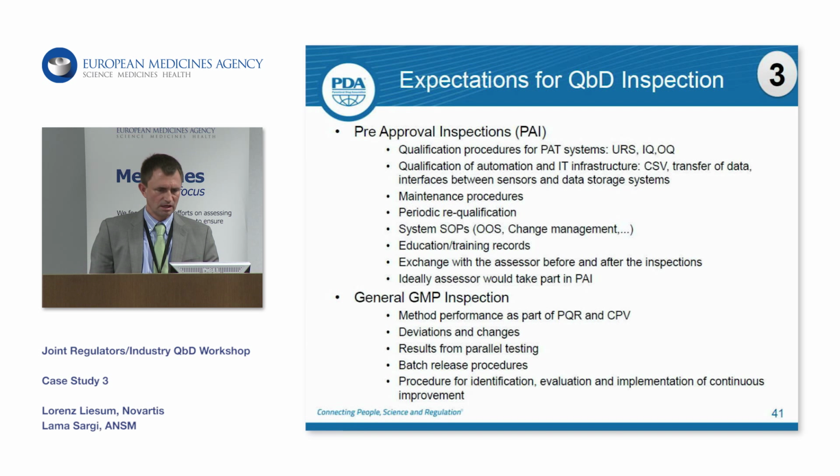It is a crucial point, of course, as a basis for all this, to have a complete and sufficient qualification of the PAT systems, starting at the user requirement specifications and going through the complete qualification process.